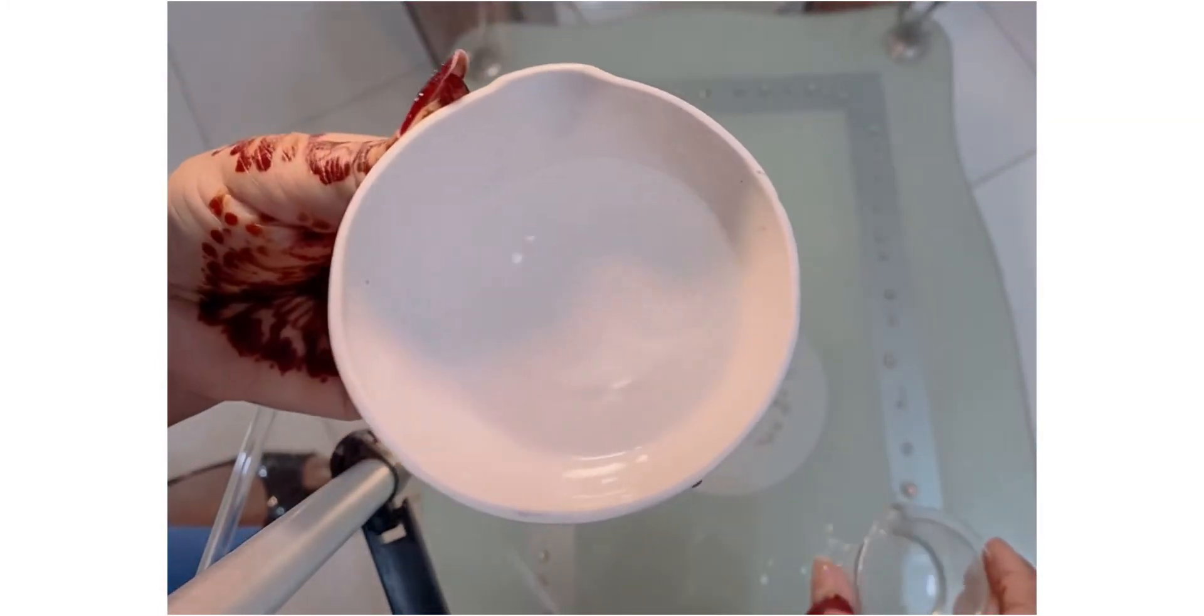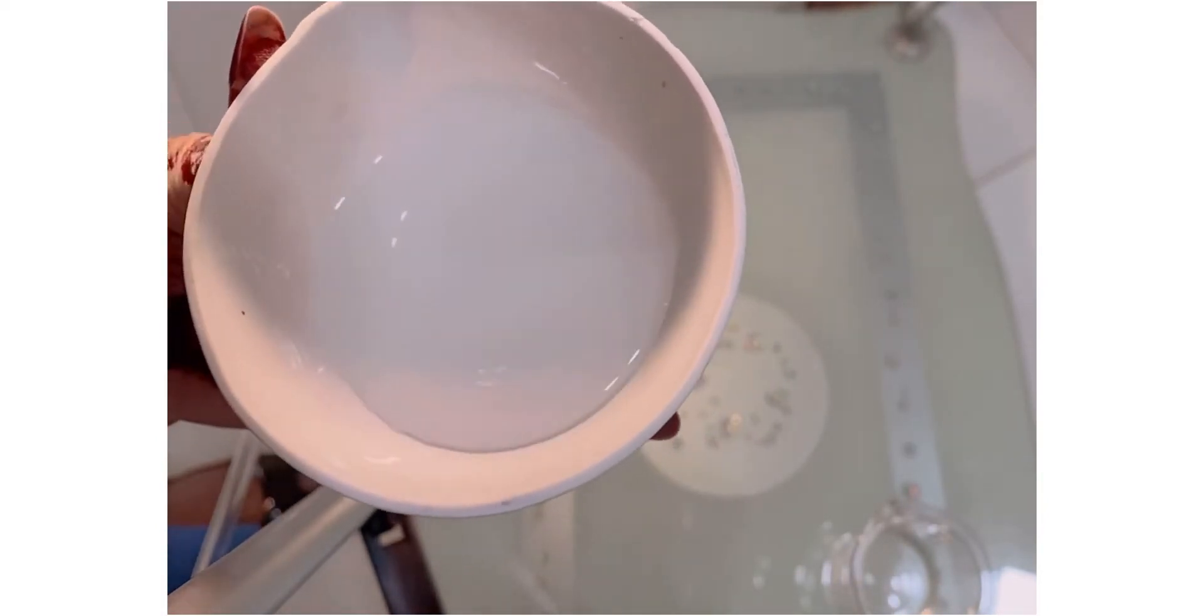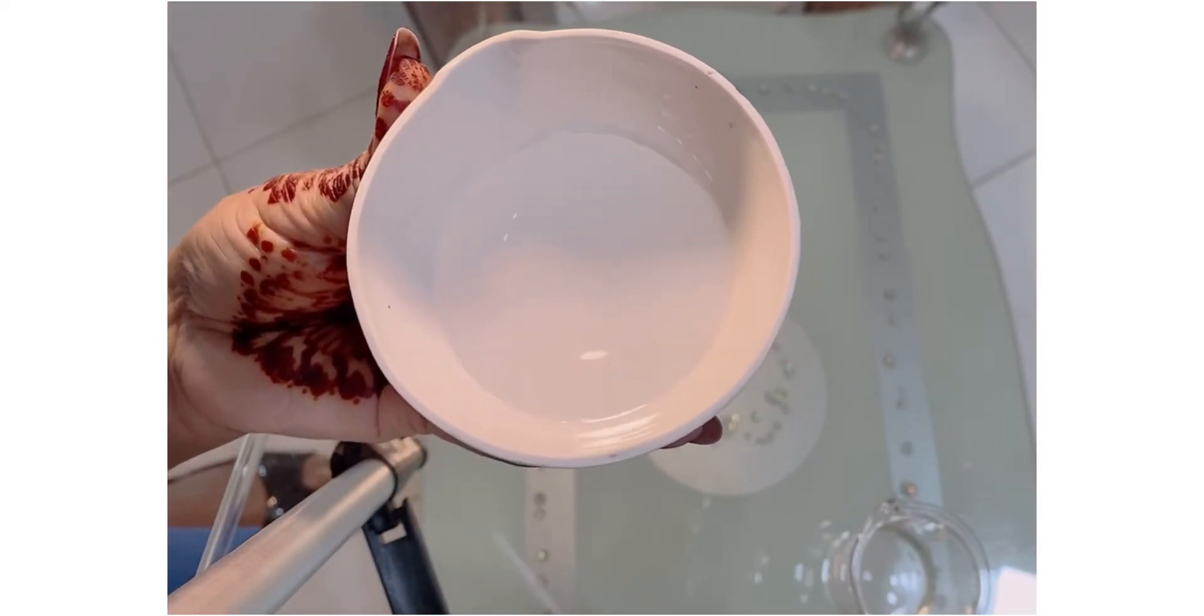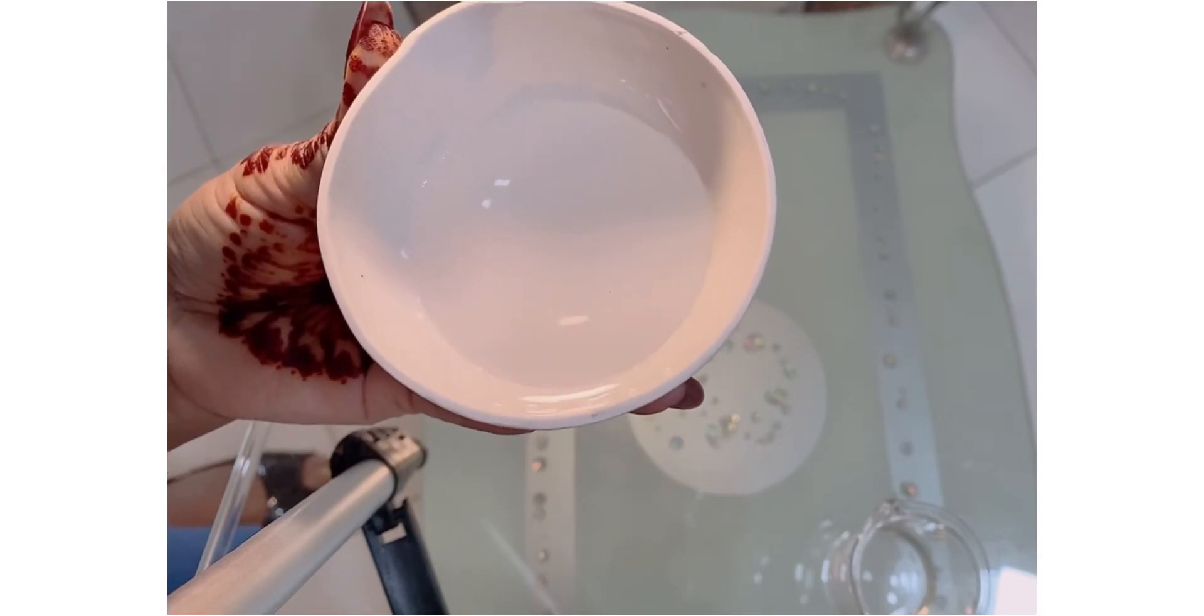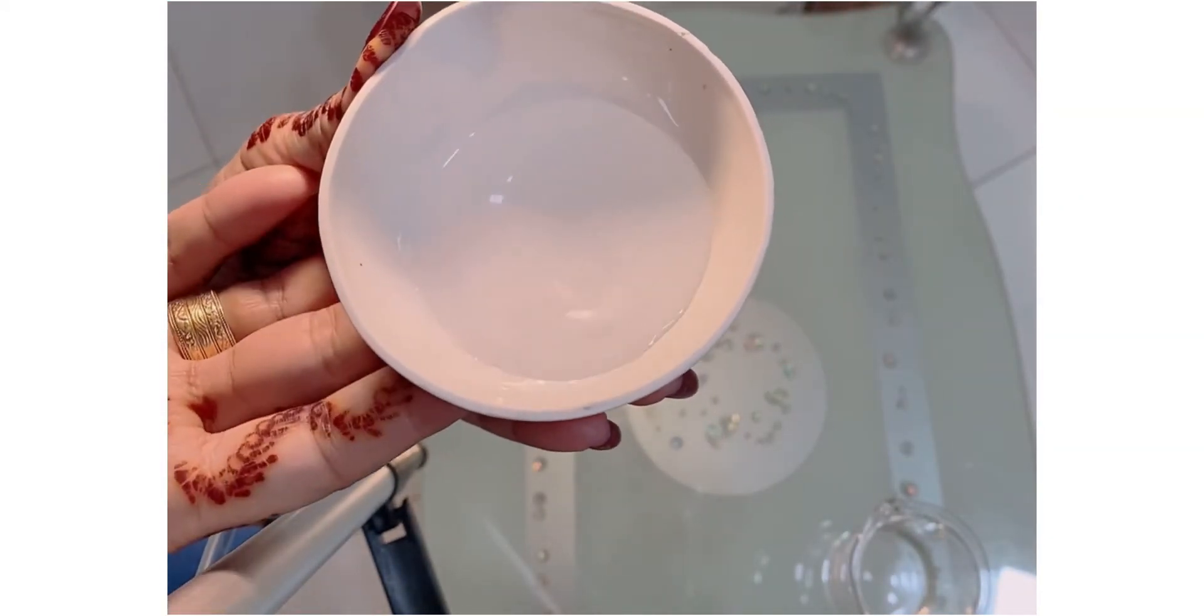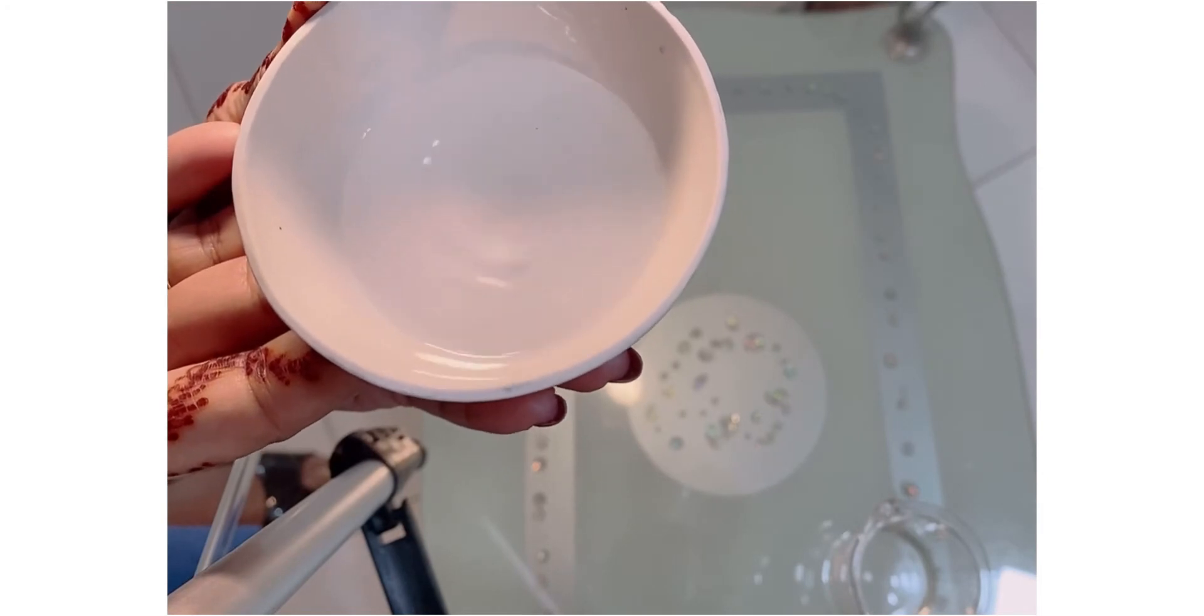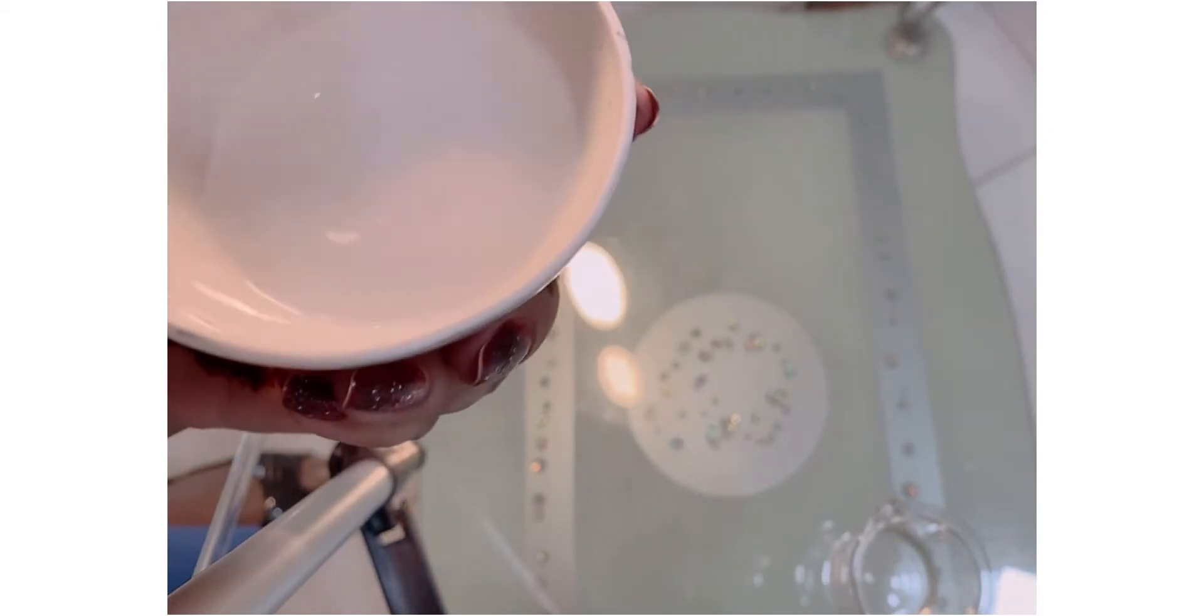For example, you can take the example of water. Now if I need to reduce the volume, if it is almost 5 to 6 mls, if I need to reduce it over the flame, I can simply reduce it easily because now it has all the chances to get the liquid escape and it won't condense back and fall back to this water level. Resulting that this solution will be reduced in a very little time. So basically it is a heat resistant container used in the labs.